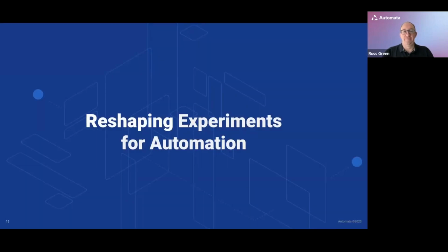So how do we address this stuff? How do we reshape those experiments to allow us to build automation? If all these things are challenging for us, then what can I do in terms of my experimental design to adapt them and make them more automation friendly? Really, the reason why we'd want to do that is to make it more likely that our adoption of automation is successful. And going back to some of these challenges, when we spend a lot of time building deeply customized systems and a lot of bespoke widgets, that tends to drive a higher chance of failure, both a failure point within the system and a failure in terms of adoption, because the implementation time tends to go up.